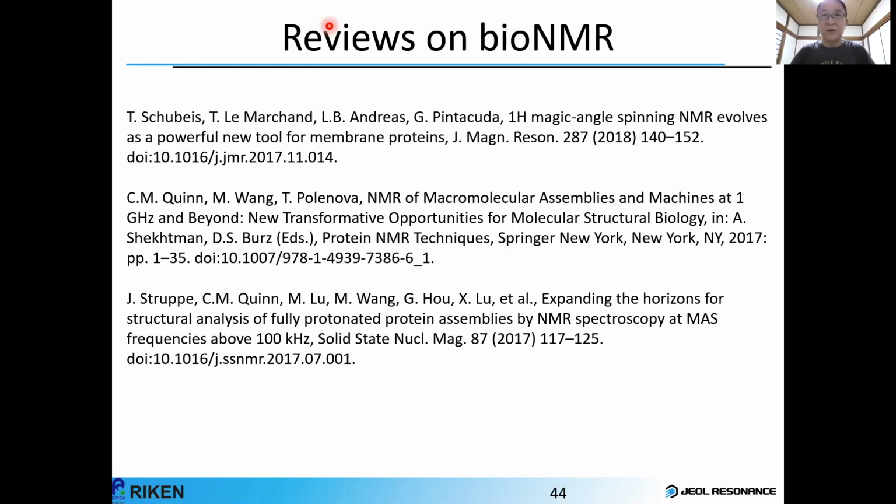But fortunately, spinning is much less affected by the condition of the cap. Even with a severely damaged cap, we can easily spin up to 90 kilohertz. In our laboratory, we use a cap maybe 10 times or 20 times without any problems. In terms of the sample rotor, we never saw any crash.